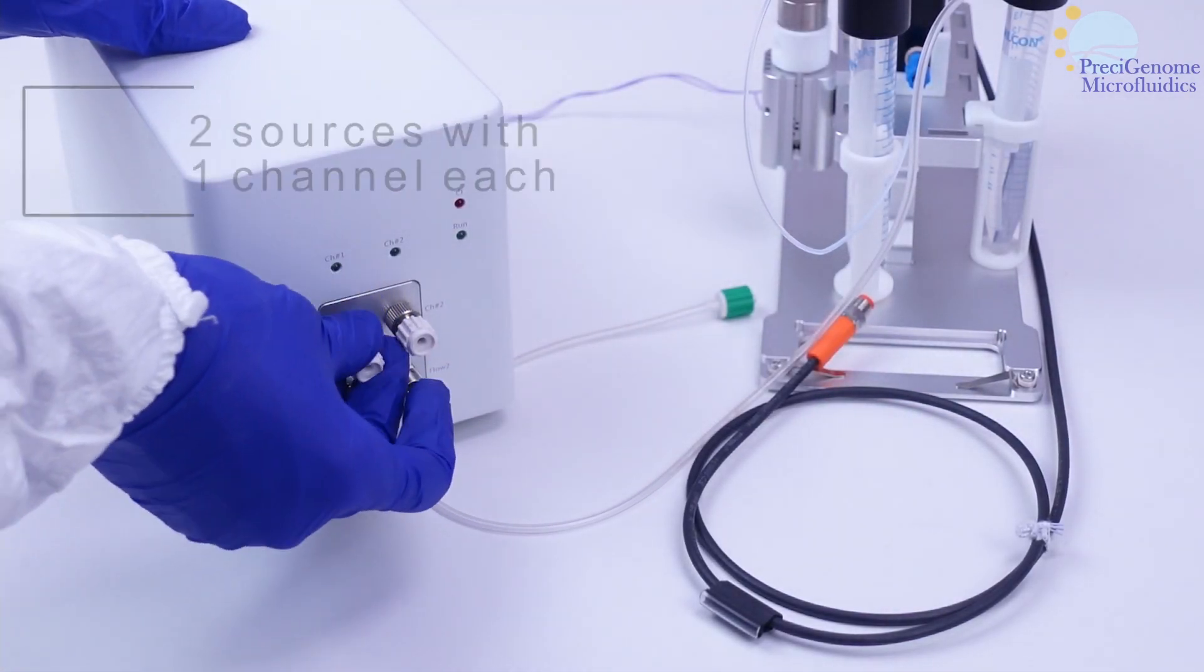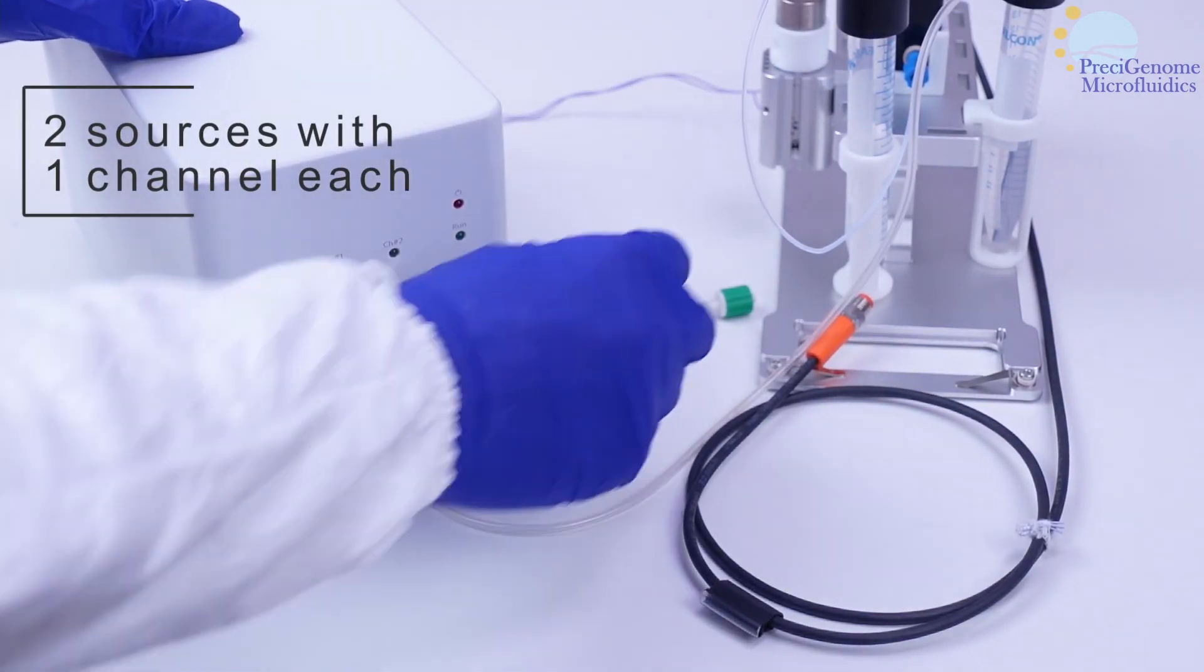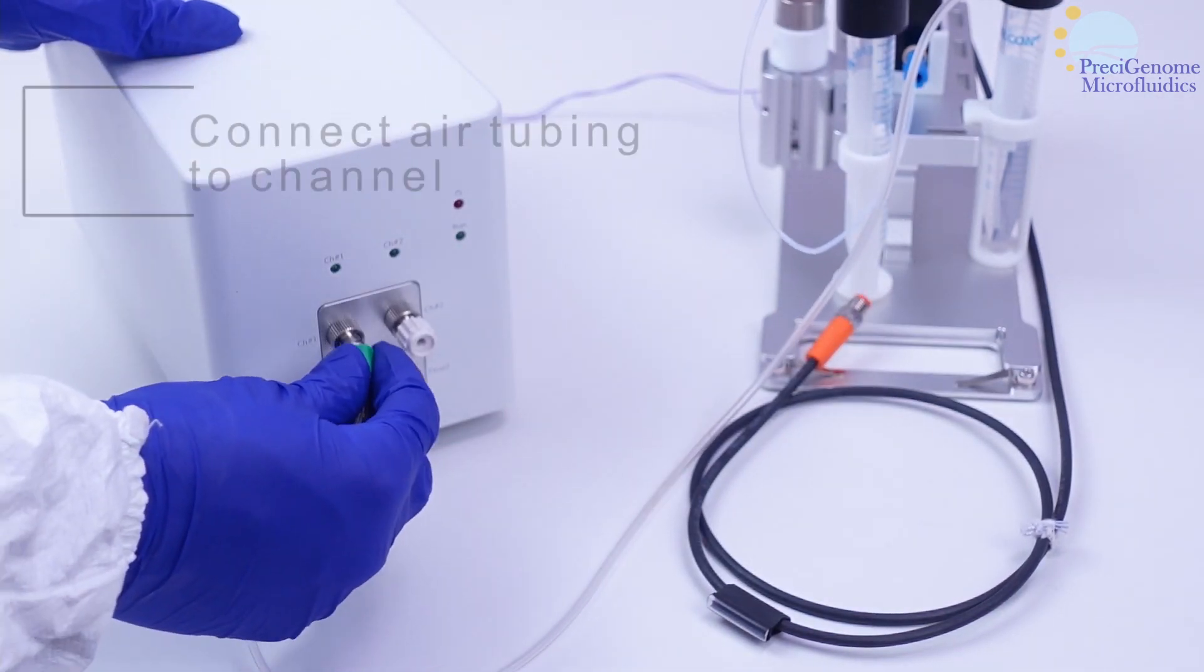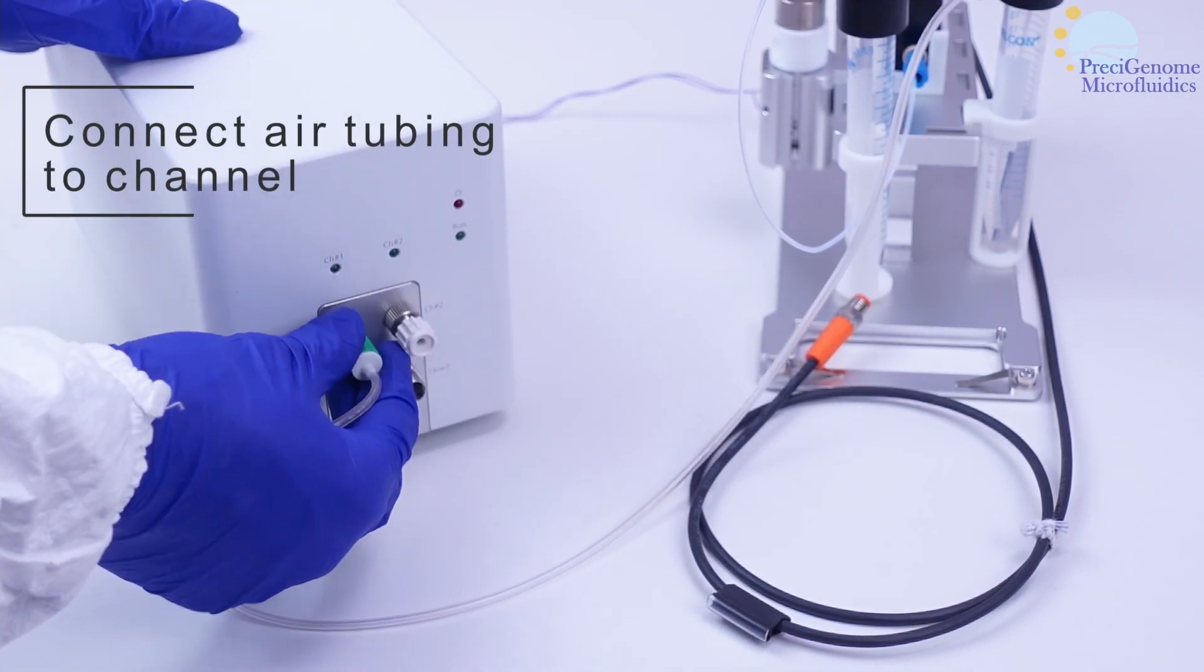The iFlowLite features two independent sources with one channel each. These connect to other components with Tigon tubing.